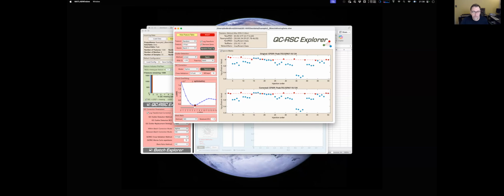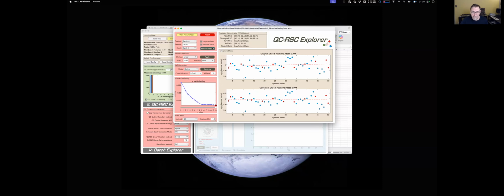So again, you look at your data, you look at your data set. Particularly, I find that you would normally optimize the settings for a given assay or lab, and then save it out in a configuration file. And that's what you would use for any experiment that's gone through that workflow.